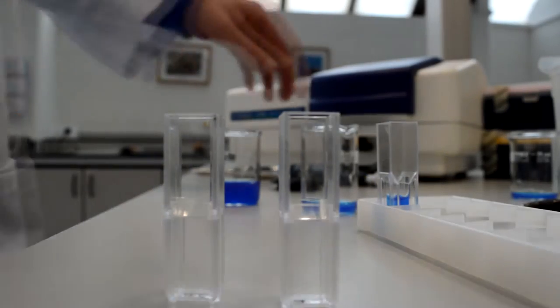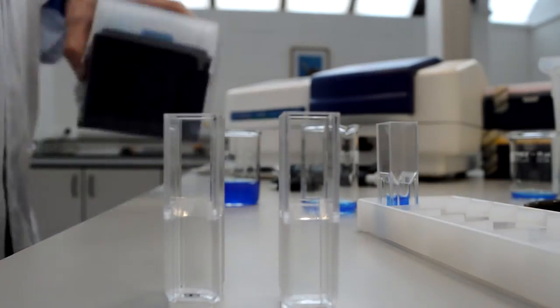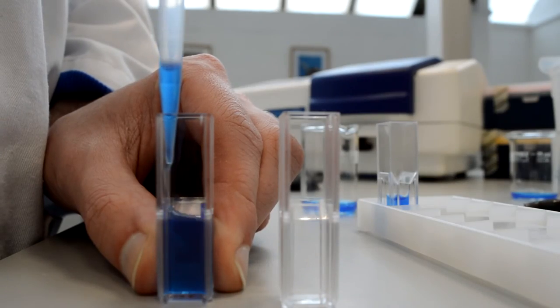So using a spectrophotometer is really simple. What you need is one of these little cuvettes. They're right here, and they're nice and clear. And all you're going to do is you put your solution into these and then into the spectrophotometer. There's a couple of things you need to make sure of first. First off, you need to make sure your spectrophotometer is on, unlike this one, and you need to make sure it's calibrated to the right wavelength of light.